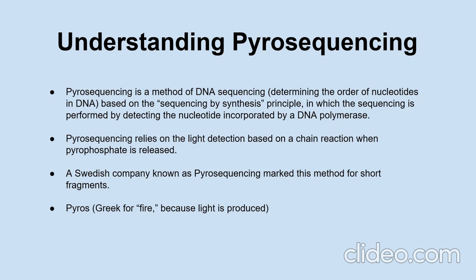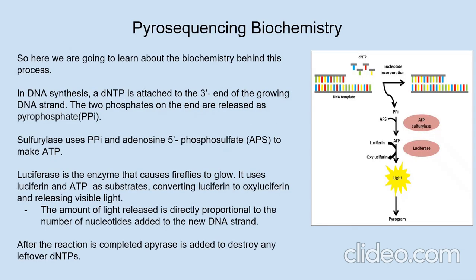So basically, pyro in Greek means fire, because light is produced in this process. Further, pyrosequencing biochemistry. Here we are going to learn about the biochemistry behind this process.